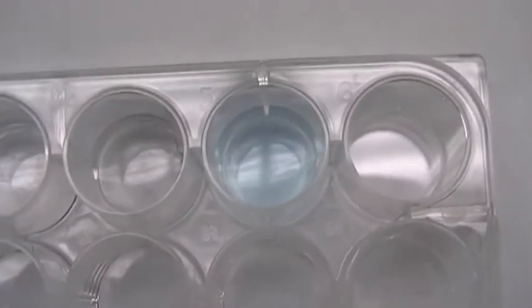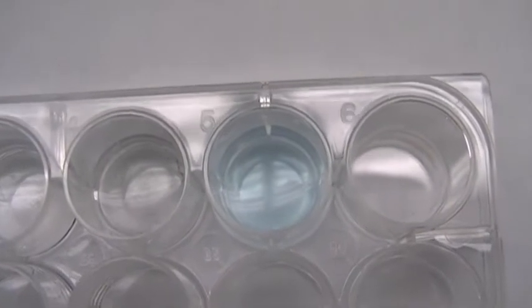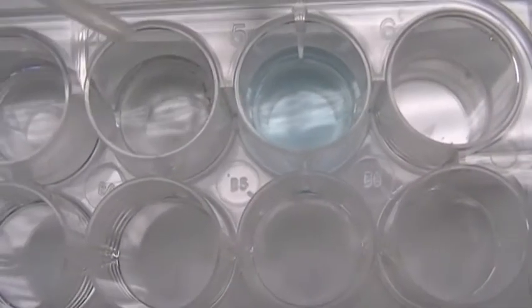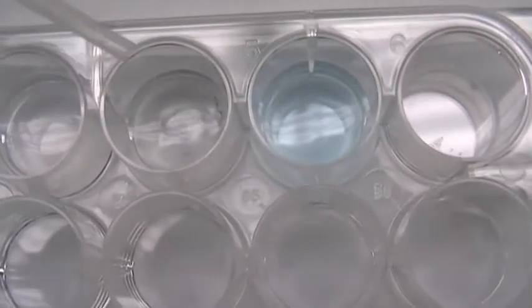Alright, and now into the silver with 1 drop of copper nitrate.